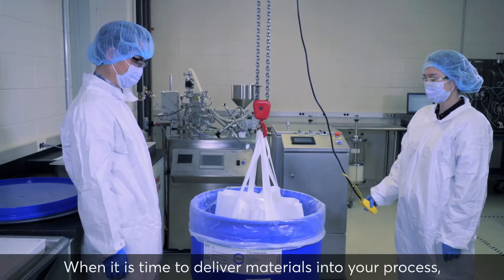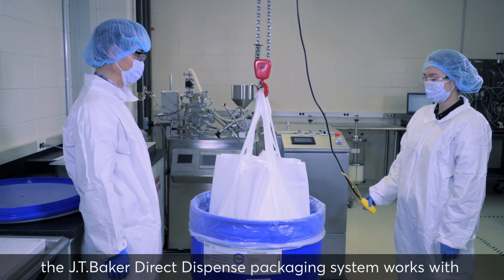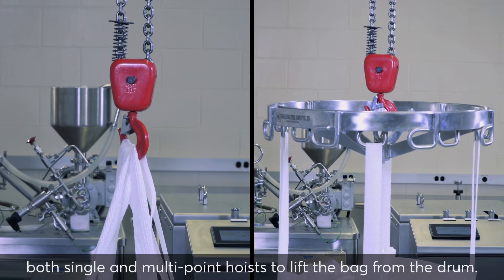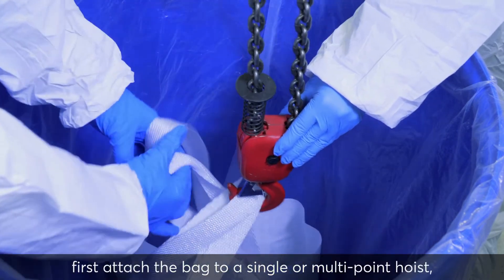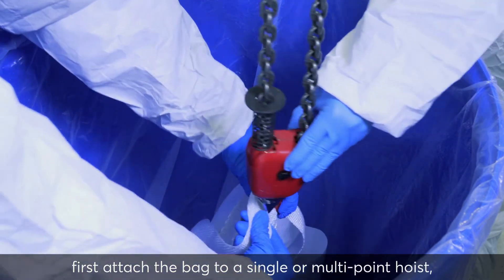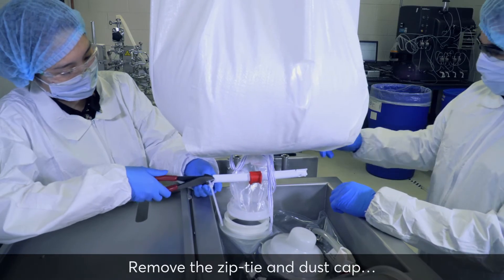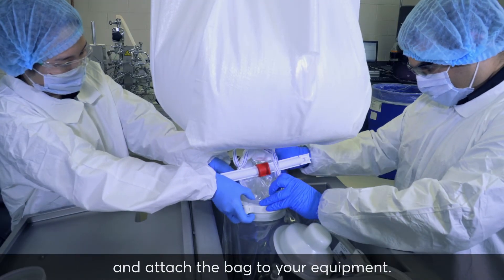When it is time to deliver materials into your process, the JT Baker Direct Dispense Packaging System works with both single and multipoint hoists to lift the bag from the drum. To dispense product, first attach the bag to a single or multipoint hoist, lift and position the bag, remove the zip tie and dust cap, and attach the bag to your equipment.